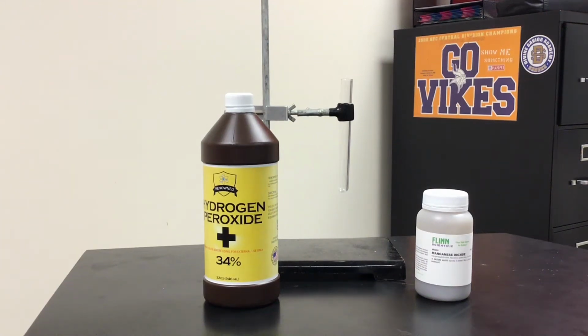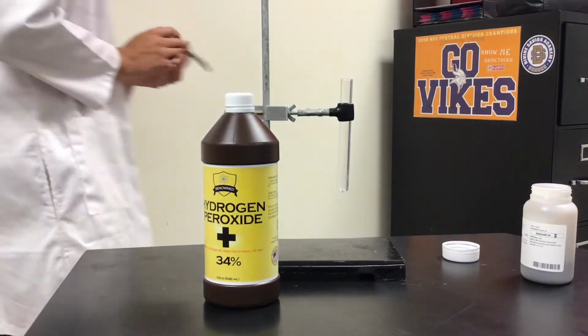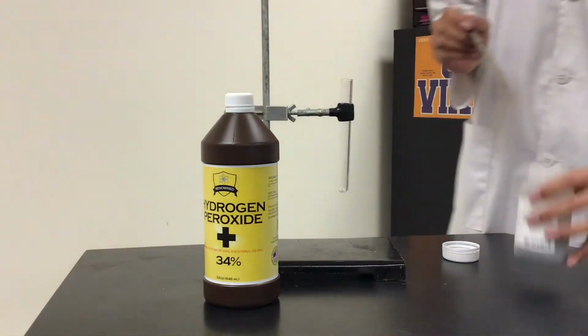This is type of reaction observation number 1. Manganese dioxide catalyzed the decomposition of hydrogen peroxide into water and oxygen gas. First, I'm going to place the manganese dioxide into the test tube.